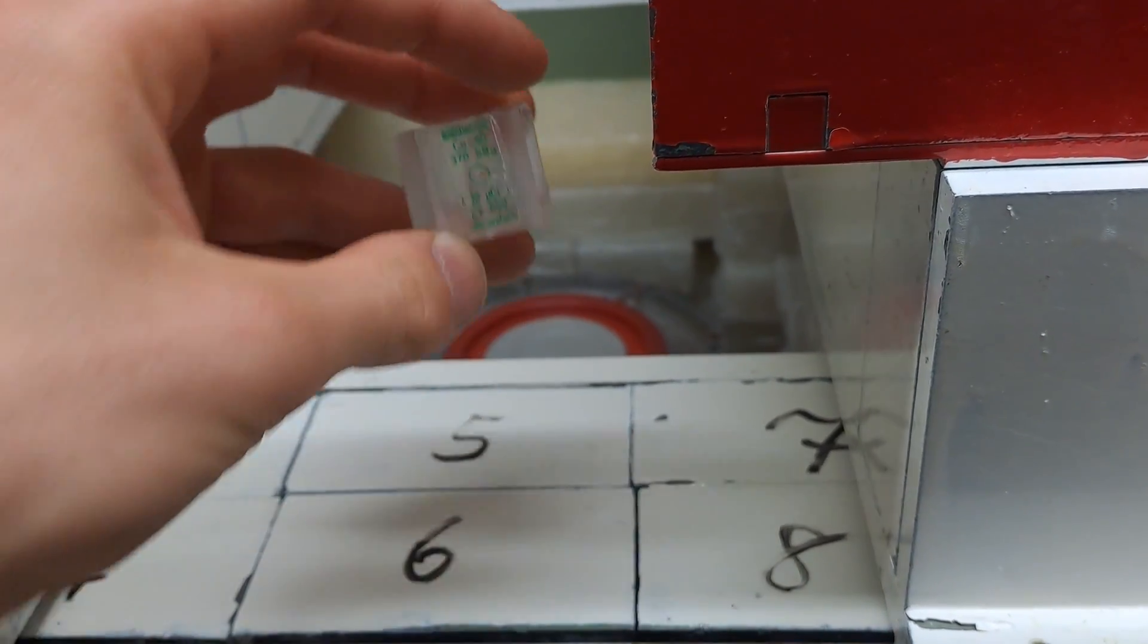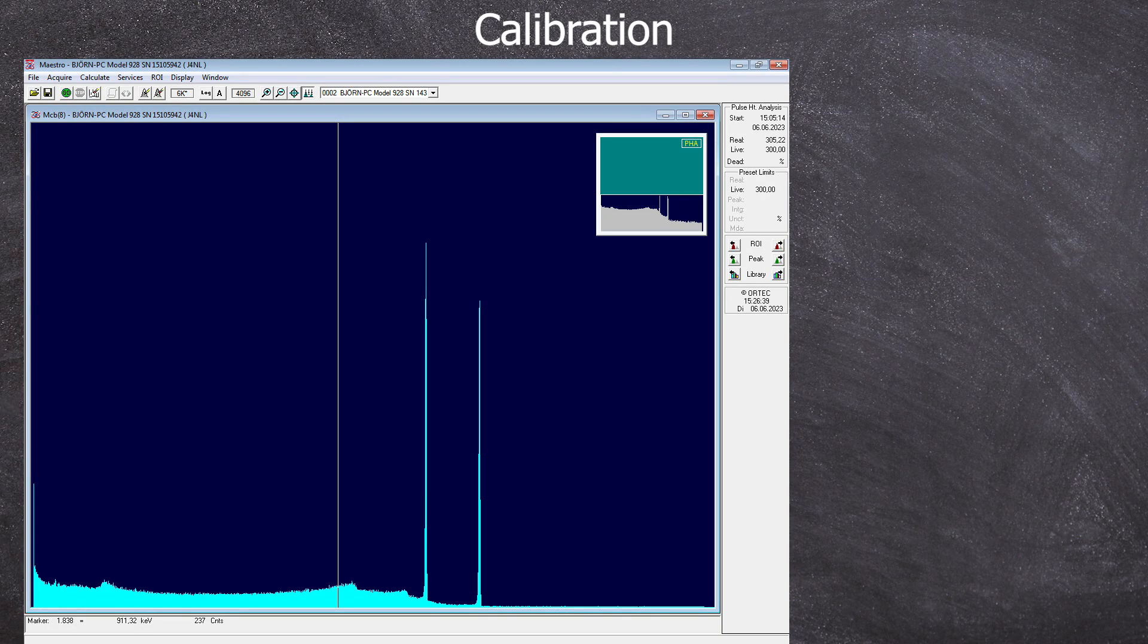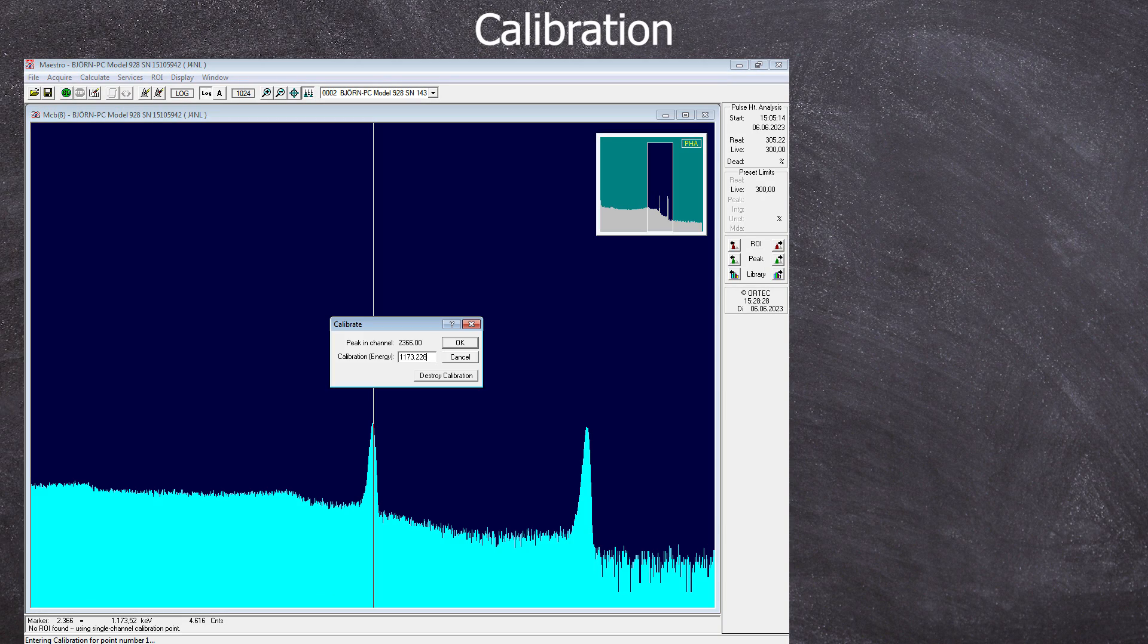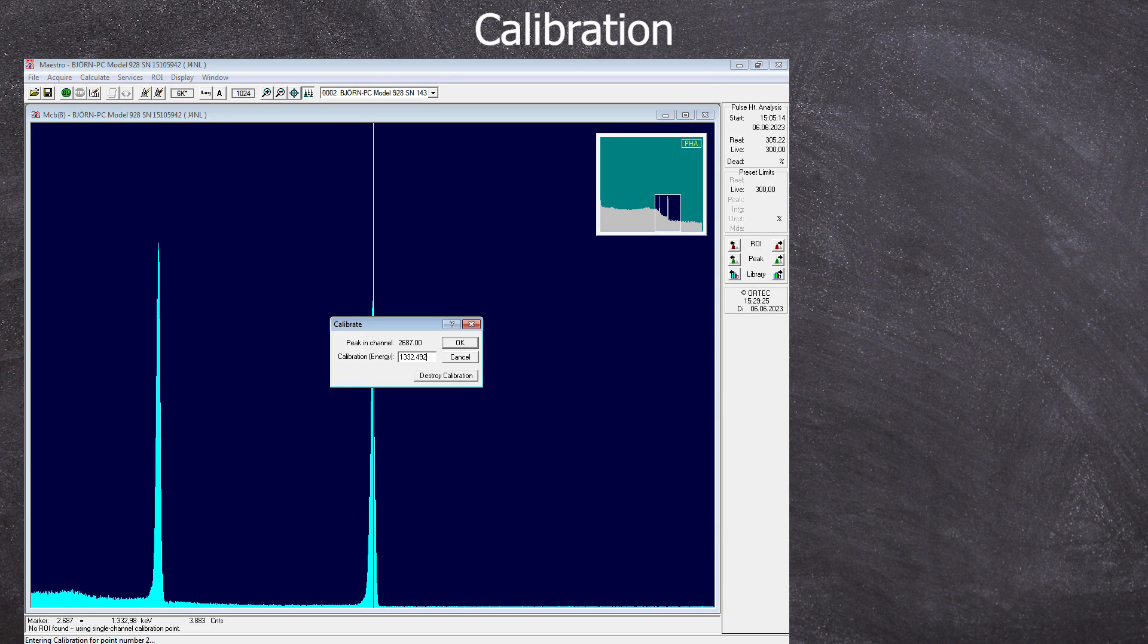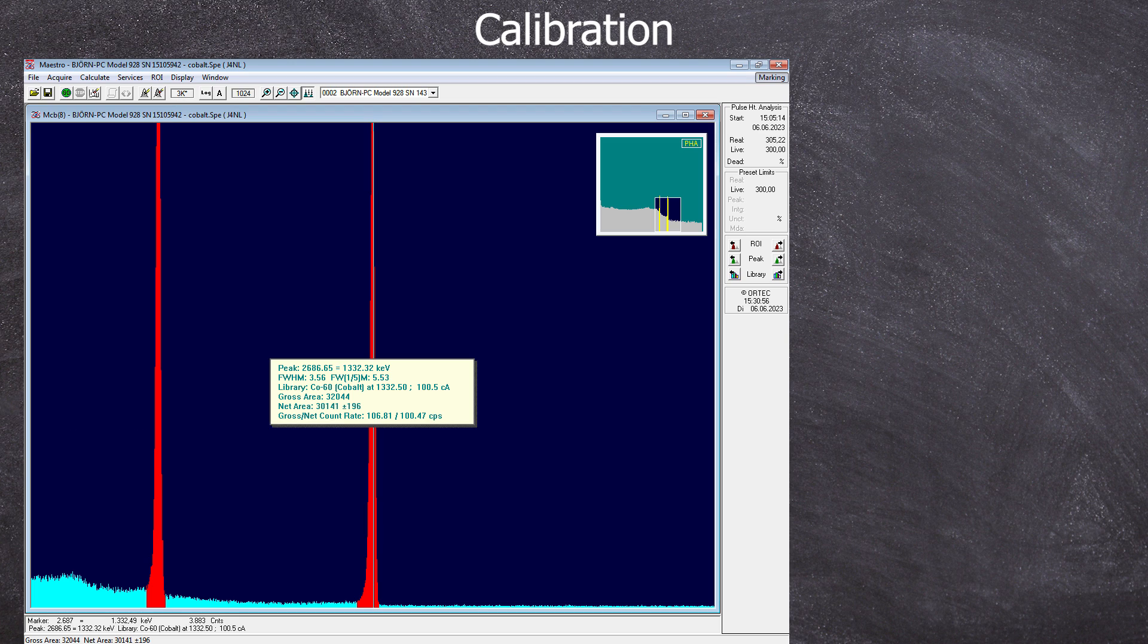Now to proceed with Cobalt-60. This element has two gamma peaks, one at 1173 keV and the other at 1332 keV. For the lower energy peak, the ROI shows a count rate of 115 CPS. And for the high energy peak, it's 101 CPS.